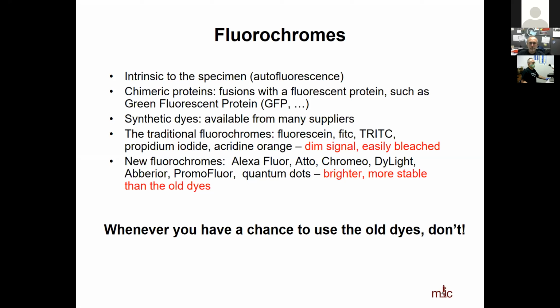Typically, these dyes are much brighter and more photostable than your fluorescent proteins. So some are the traditional fluorochromes like fluorescein or FITC, acridine orange, some other dyes. A lot of these are well known, but they are somewhat dim, not as bright. They are not as photostable.